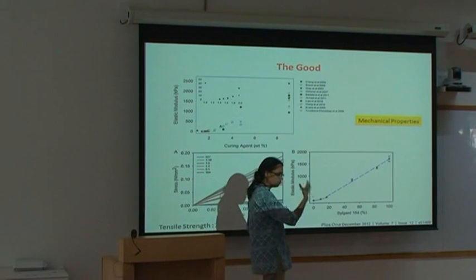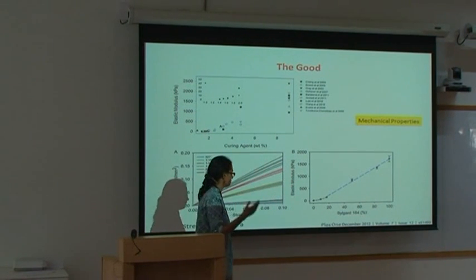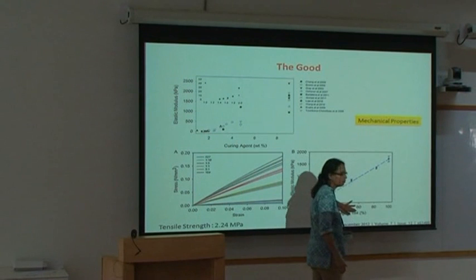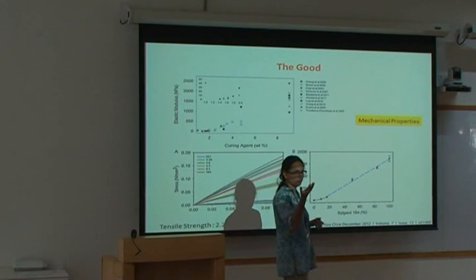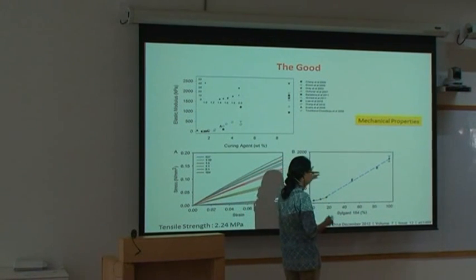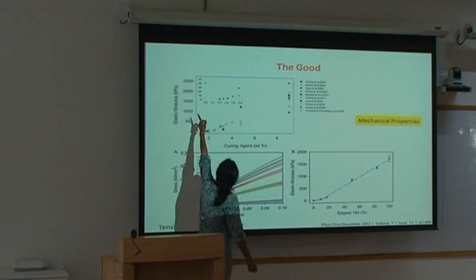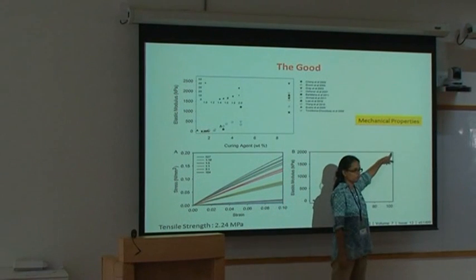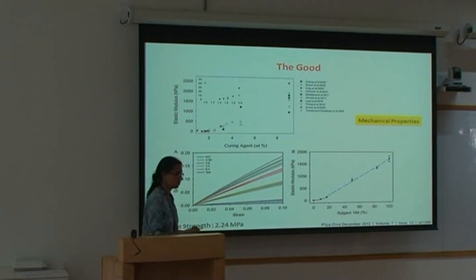There are other ways to change stiffness, like I think Firoz might talk about, by growing patterns on it or having PA gel, which can take it to a lower range. But this is a commercial pre-polymer, and it has its own patented cross-linker which you can use to make PDMS. That's what we were using for the workshop. There are other kinds with modifications which I really don't know about, and you can see here that by mixing these two kinds of pre-polymers, you can go from something really low, I think about 10 kilopascals, to almost 2 megapascals. So you can have a huge range of stiffness with these substrates.